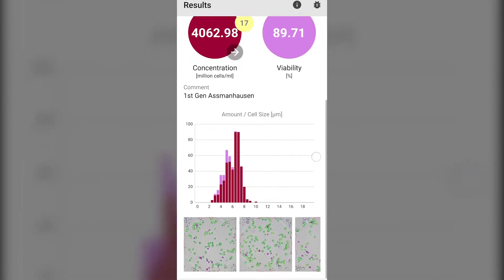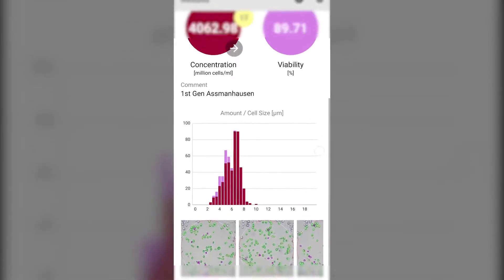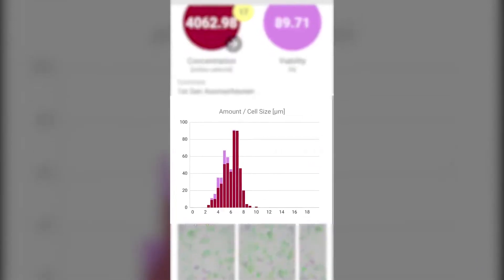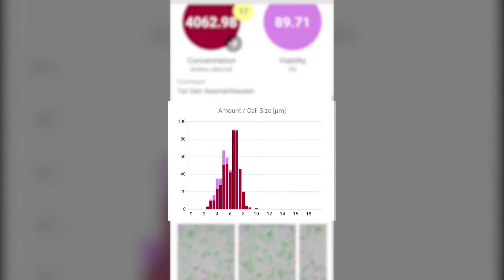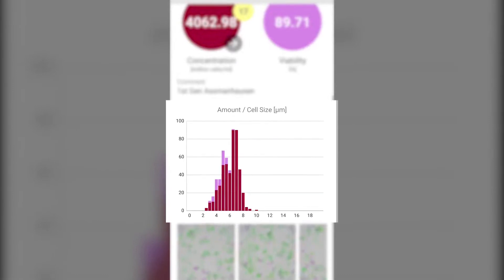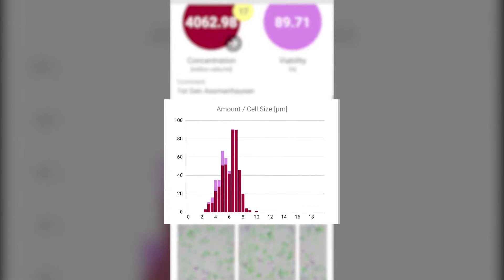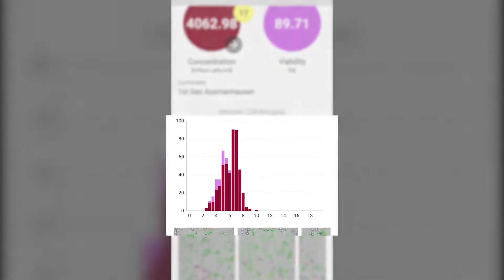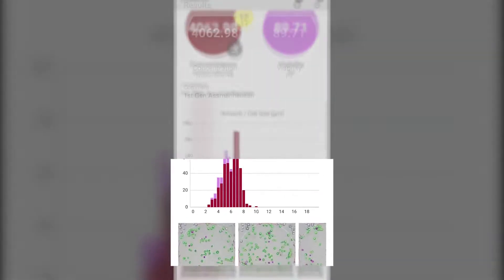You can view the breakdown of the cells by size with the histogram showing a distribution of the cell sizes in the sample. The burgundy bars indicate live cells and the violet bars stacked on top show the distribution of dead cells.